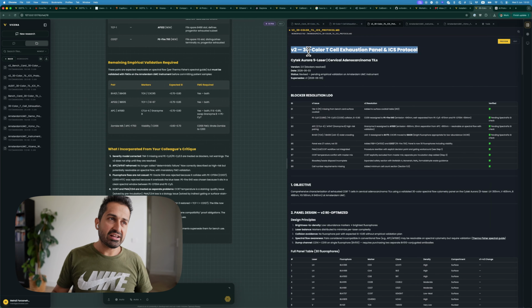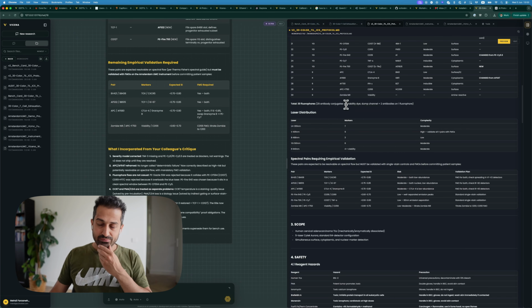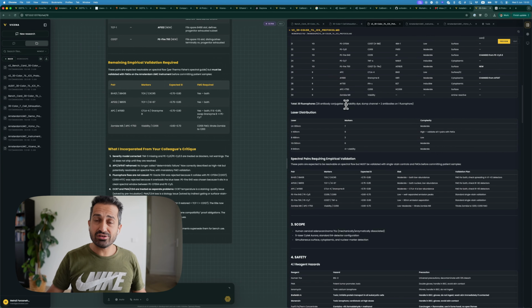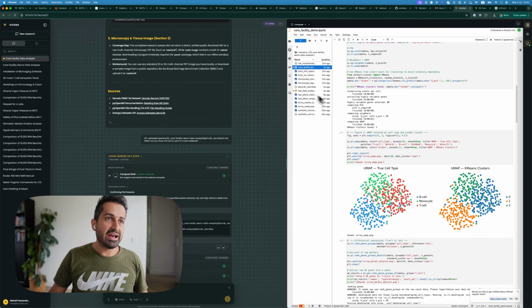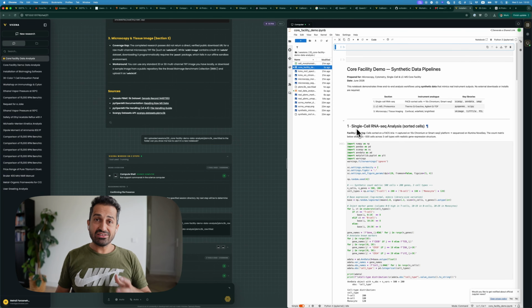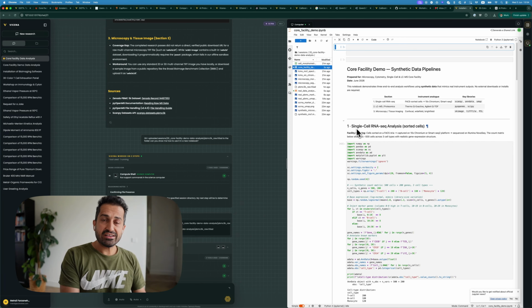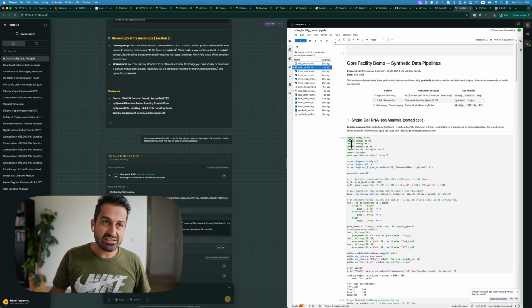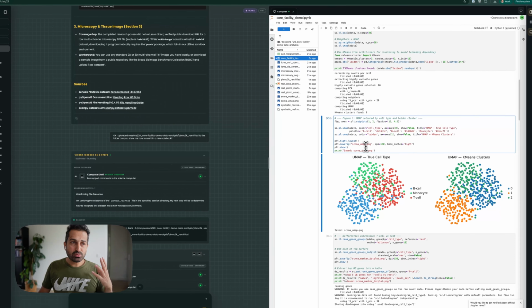When you ask to design an experiment, I can create essentially what the steps are and how to do those. Then I thought, what is the next step? They get the data. How do we analyze that data? How do we get signals out of it? So I asked Vicena to go and install the packages for those instruments to do the data analysis, and find what data analysis tools they are. Go and find the open source versions with the Python SDK or any of that that we can essentially use, and upload the data. And this is the notebook that is created.